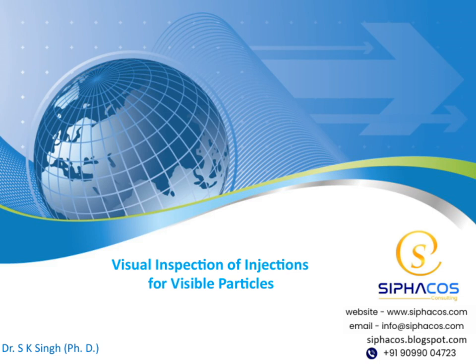Today, we'll be discussing visual inspection of injections for visible particles. This session will explore the methods and importance of inspecting injections visually to ensure safety and quality. We'll cover the key techniques, standards, and best practices involved in this crucial aspect of pharmaceutical quality control. Let's get started and delve into this vital topic.